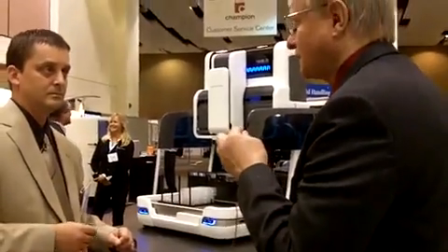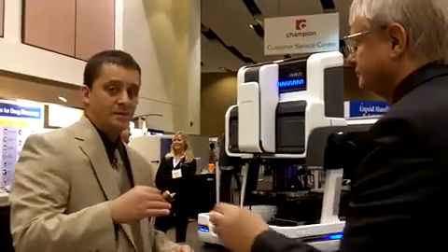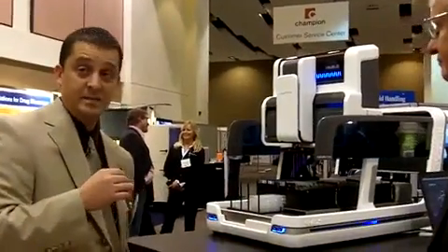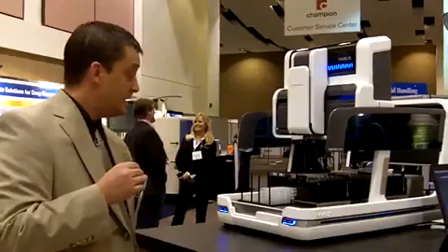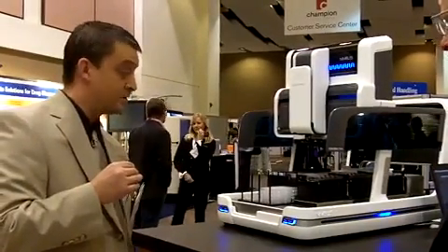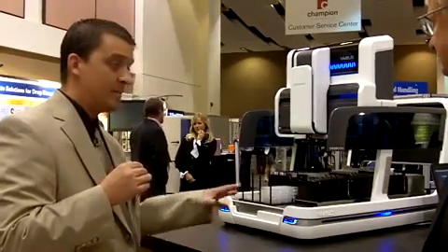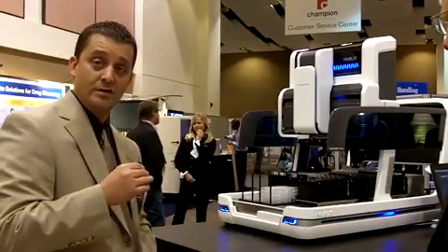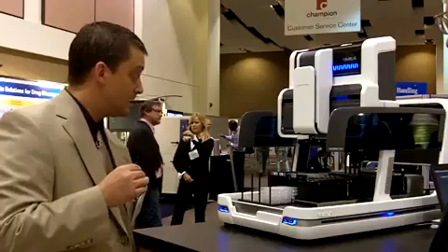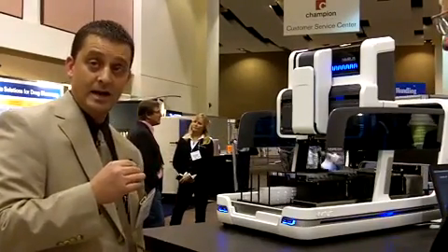How would this help your customers? What advantages would they get out of it? Well, this platform offers our customers flexibility. Because we have independent spacing on this platform, you can go from tubes to plates or plates to tubes. It also offers a compact size, so you can put it into a fume hood or environmental hood, and it doesn't occupy a lot of bench space.